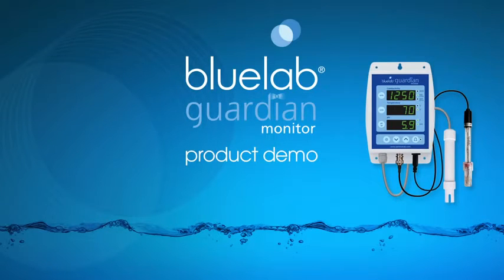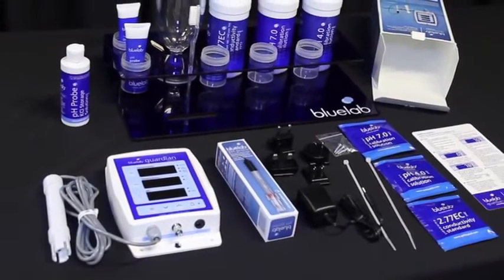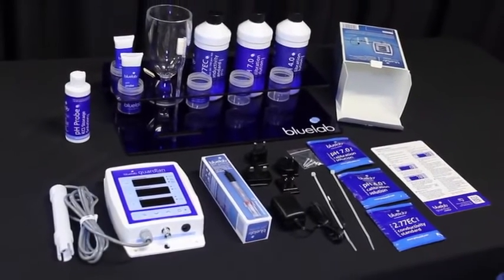Hello and welcome to Bluelab's official video on how to use the Bluelab Guardian Monitor. We will show you how to set up the monitor for the first use, calibrate the pH probe, and take readings. We have tips for care at the end of the video.